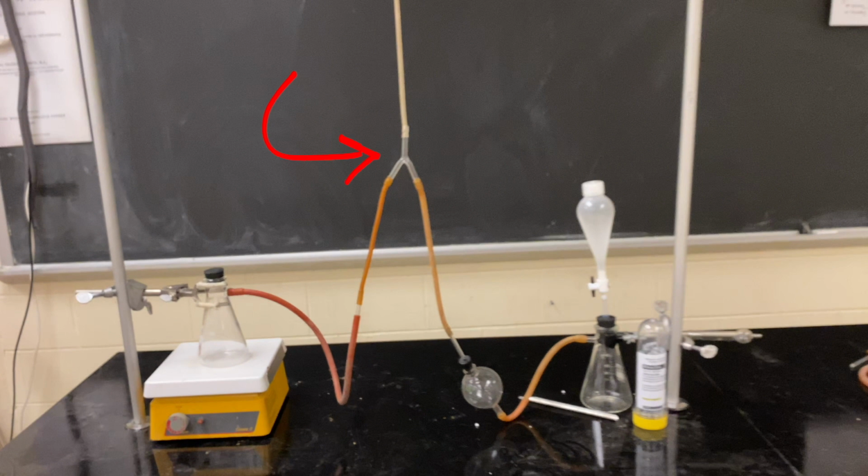The last component is the Y adapter, which allows the gases to mix from the two reactions, going to the gas outlet and mixing into the glove.